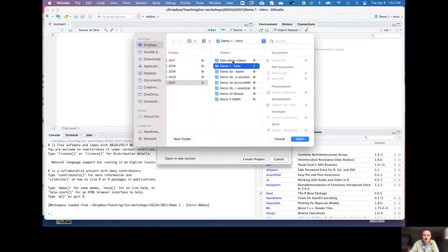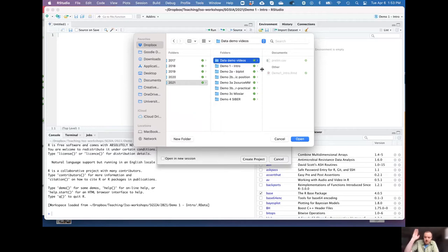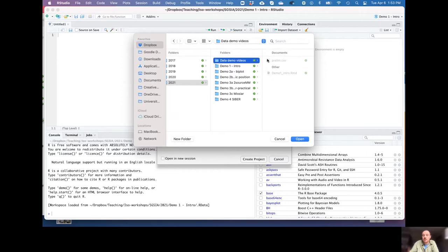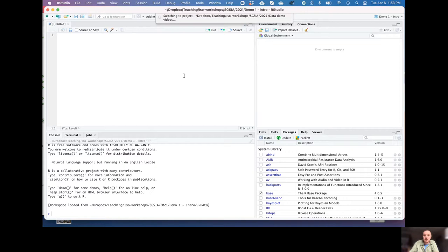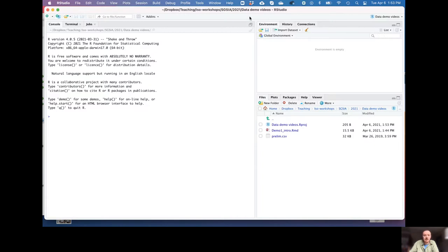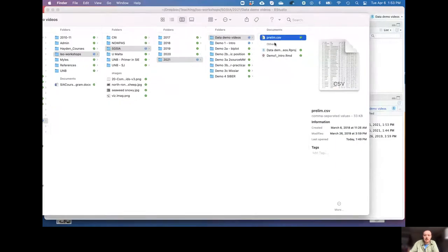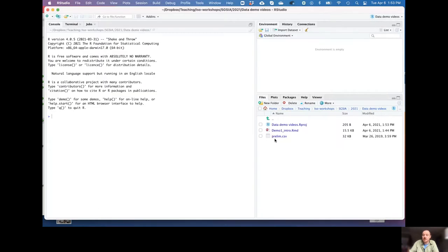In your folder you should have your prelim.csv and the markdown file. Once you click 'Create new project', it creates a new project called demo1_intro within the data demo videos folder. Now the folder is updated with this R project instance, and R knows that prelim.csv and the markdown file are present in the folder — it's reading everything that's in there.